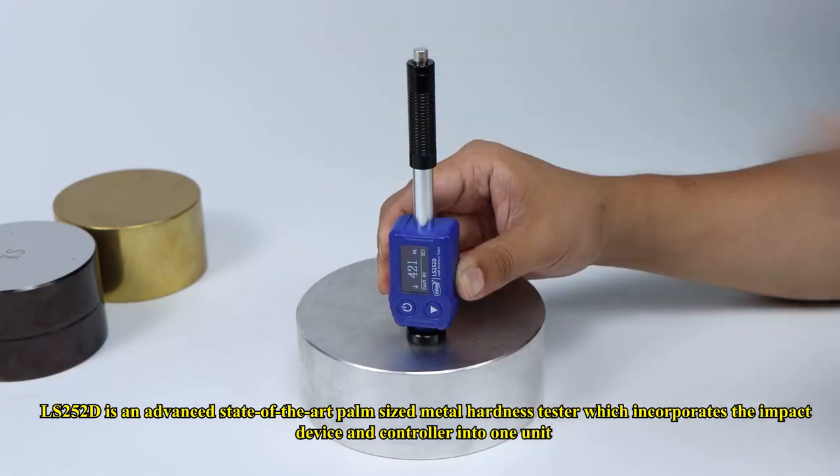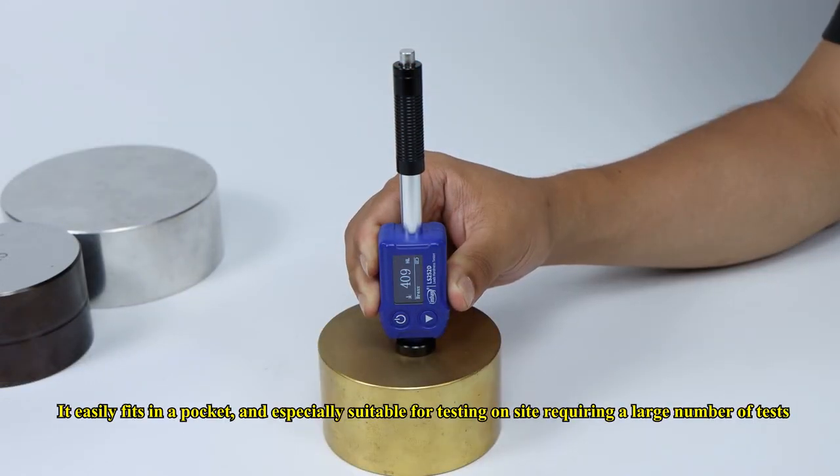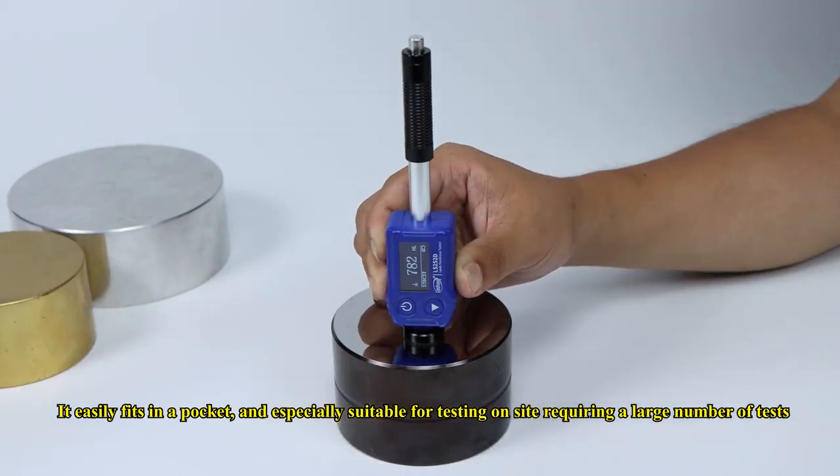The LS252D is an advanced, state-of-the-art palm-sized metal hardness tester that incorporates the impact device and controller into one unit. It easily fits in a pocket and is especially suitable for on-site testing requiring a large number of tests.